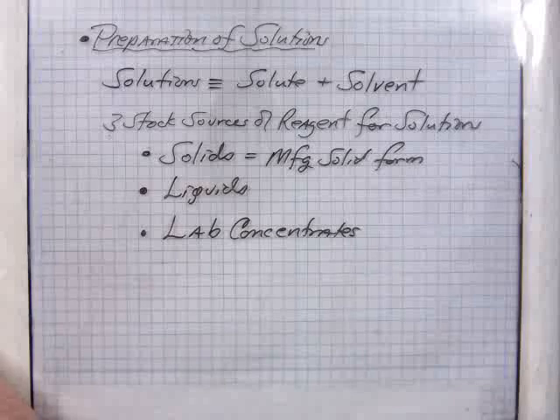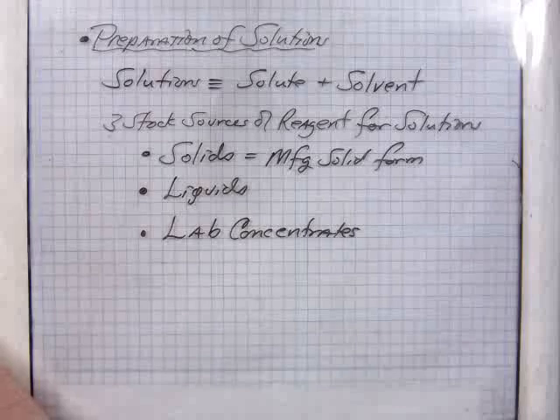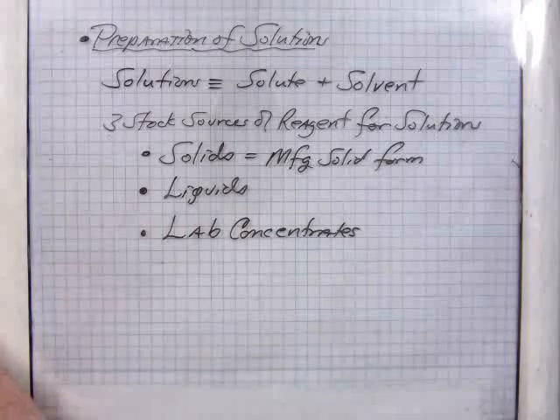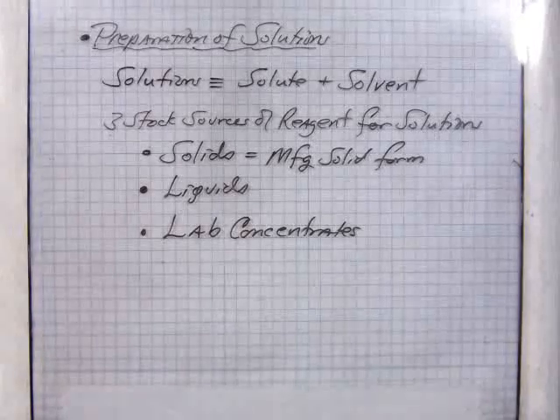And if you work in chemistry and start working in a laboratory, whatever you work with, if you're not familiar with it 100%, review the material safety data sheet or a safety data sheet that comes with the chemical. It has all kinds of basic information of how to use it, how to dispose of it, how to protect yourself if this has any hazards associated with it.